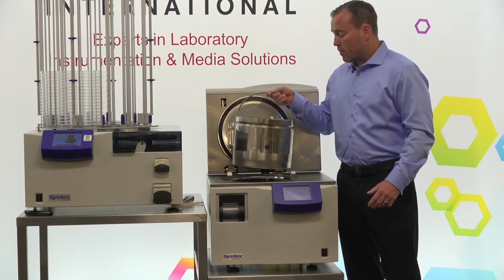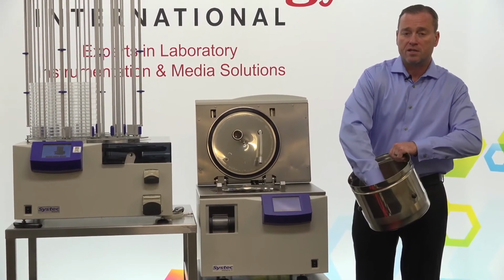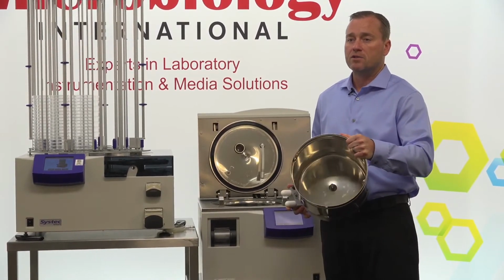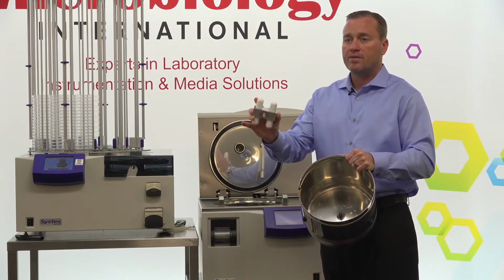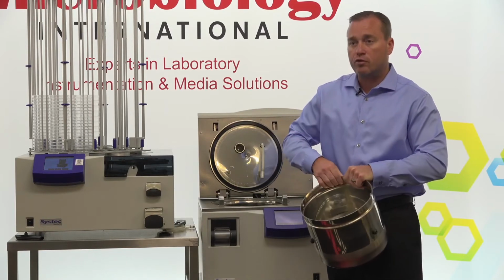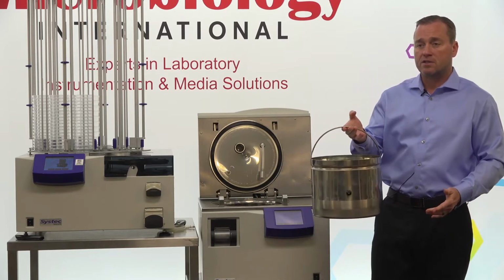The inner bucket is easily removable, so this just removes. There is a stir bar located at the bottom of it that is on a locking pin. So there's a locking pin at the bottom and the stir bar is removed. That just goes back into position after you've cleaned this out after the end of one cycle, and then it goes back into the unit.